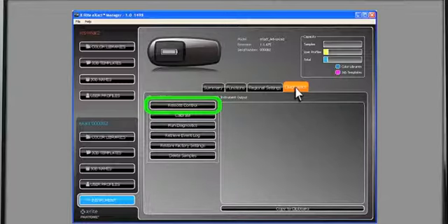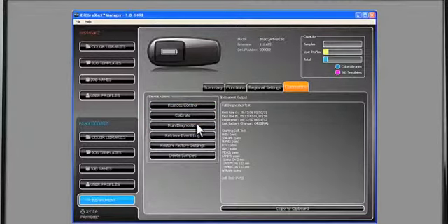Remote control is another way to control your device from your computer. It will take you to the same place as clicking on the image of your device. Calibrate will allow you to calibrate your device from the computer. Clicking Run Diagnostics will run tests on your device to see if it's behaving well. You'll see the results displayed here. These will be saved into an event log and can be copied to a clipboard.